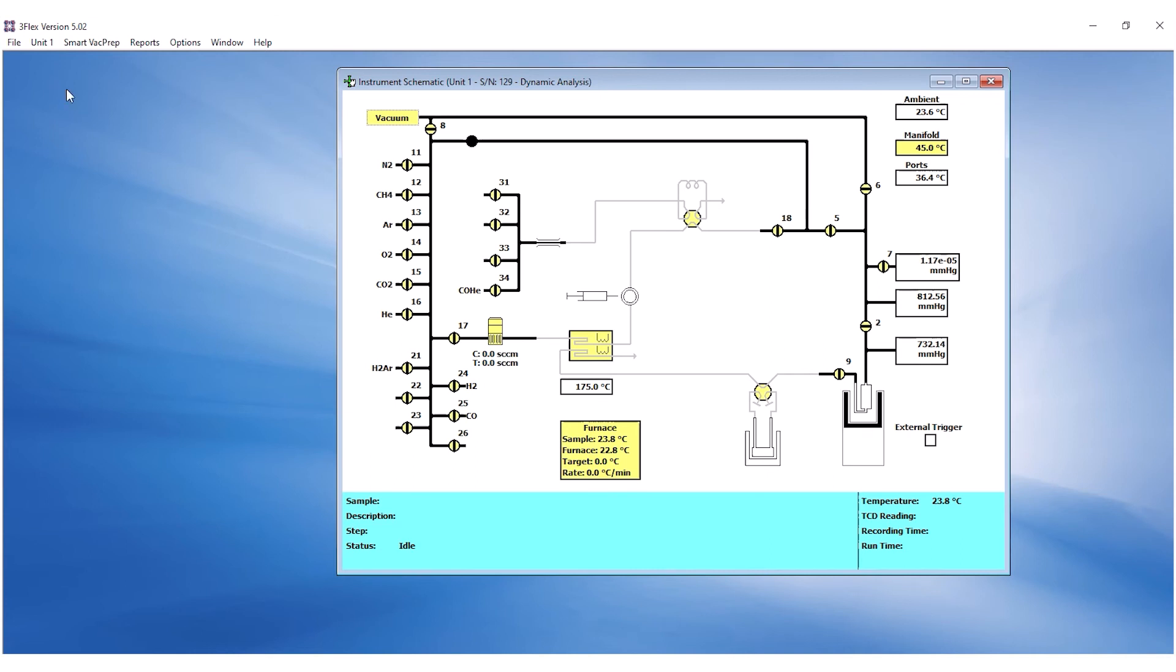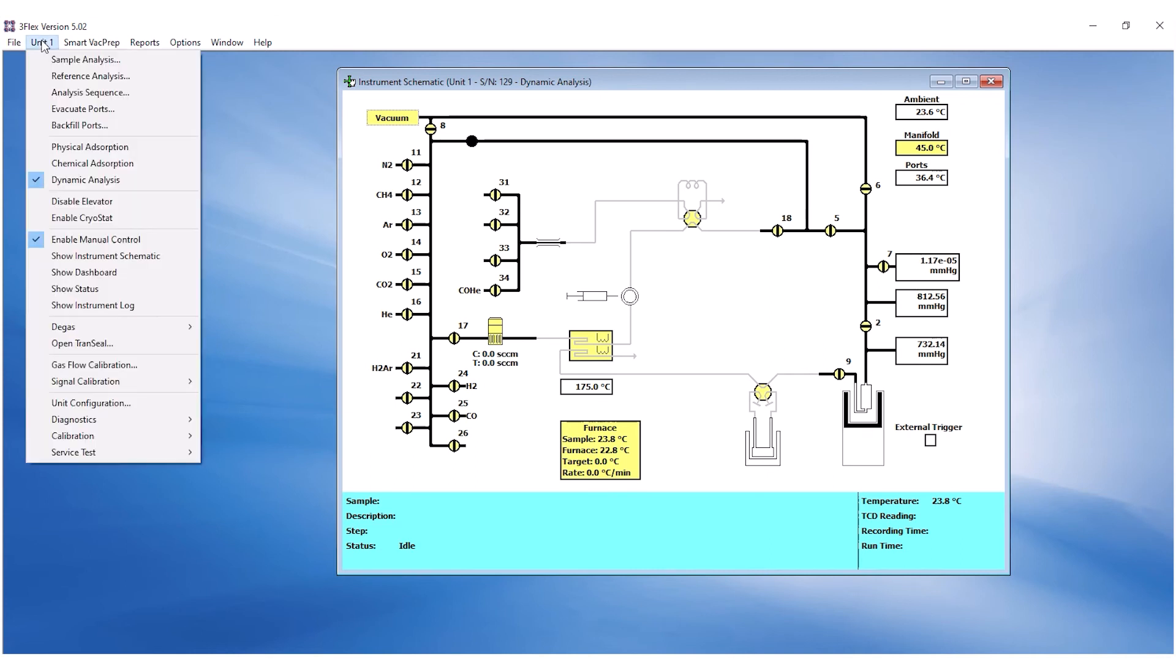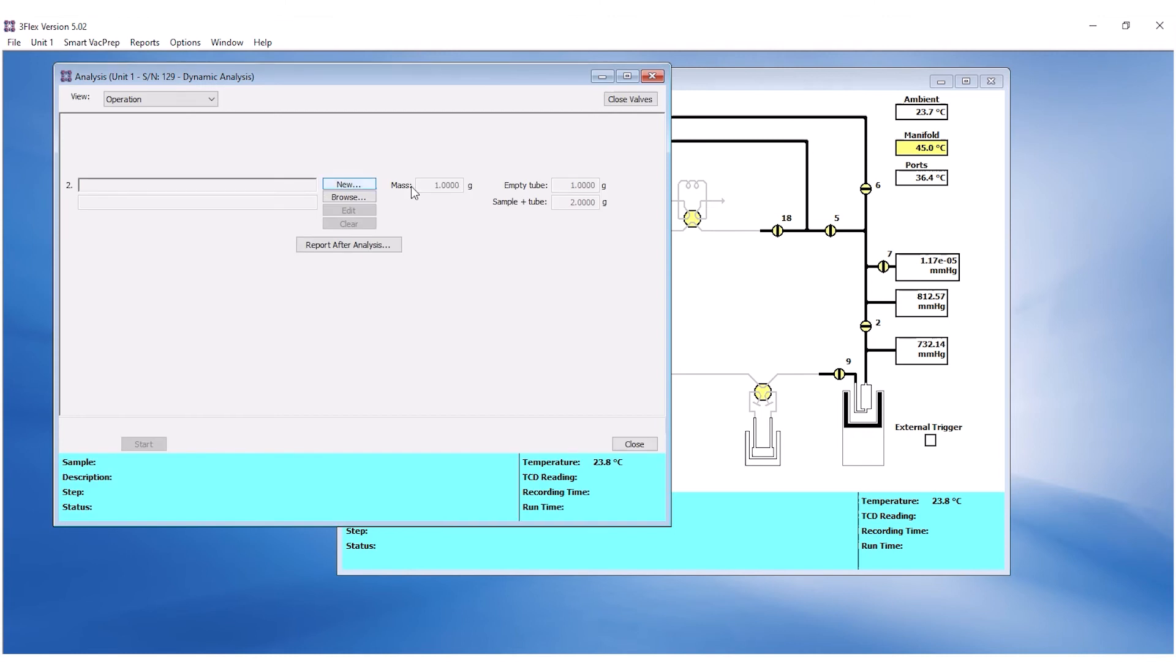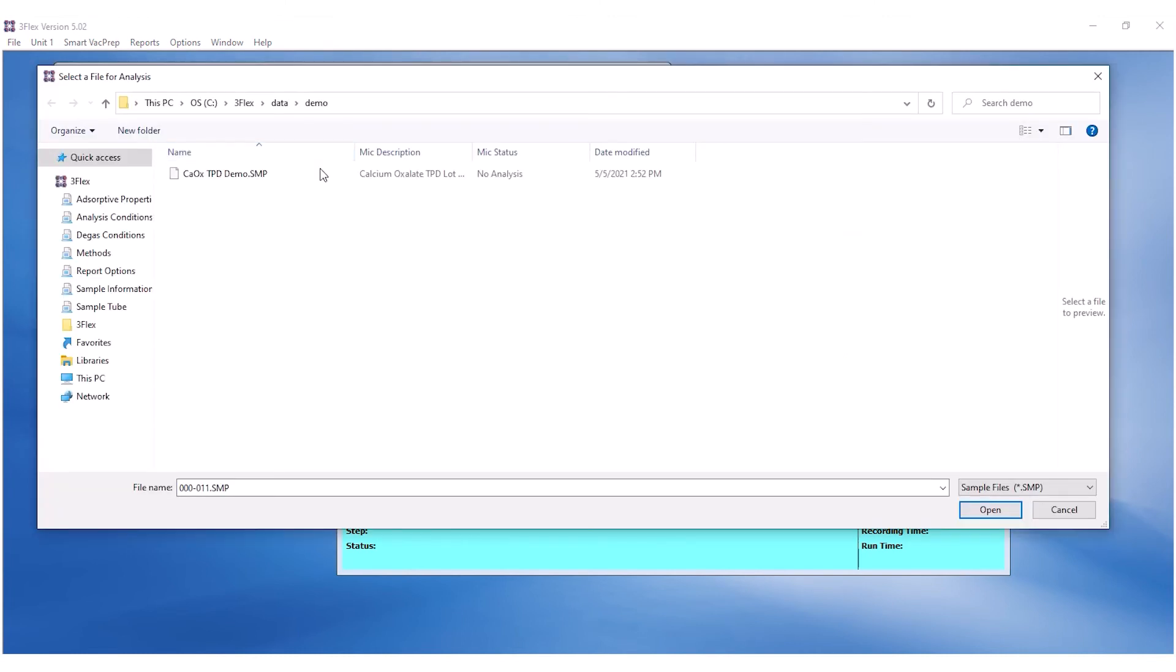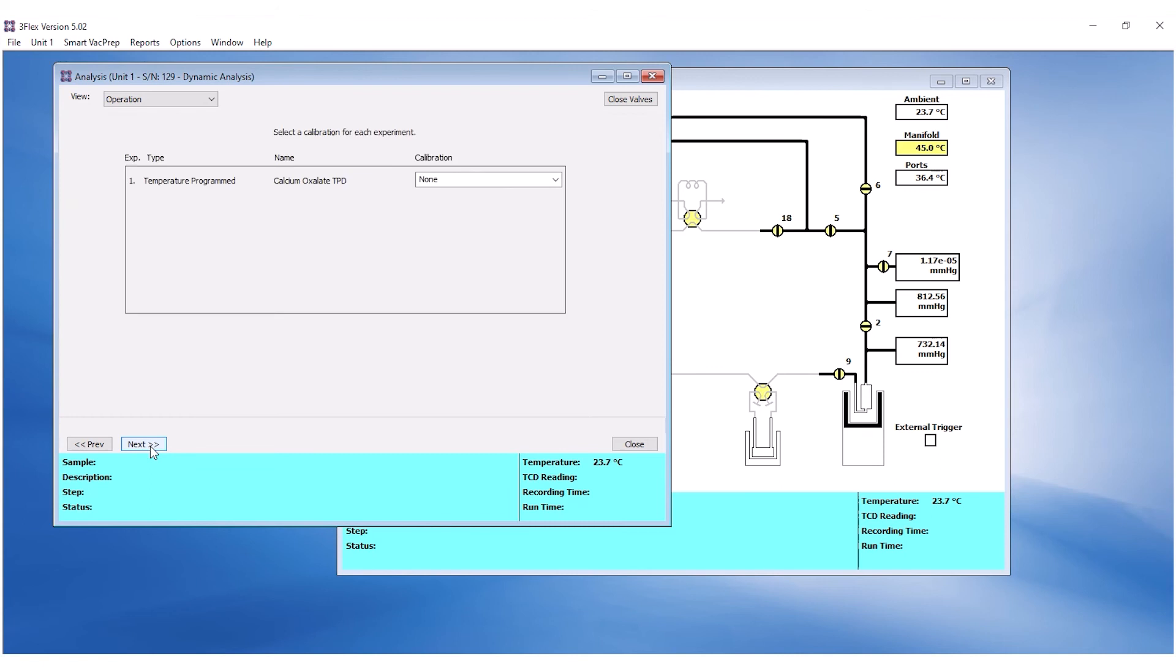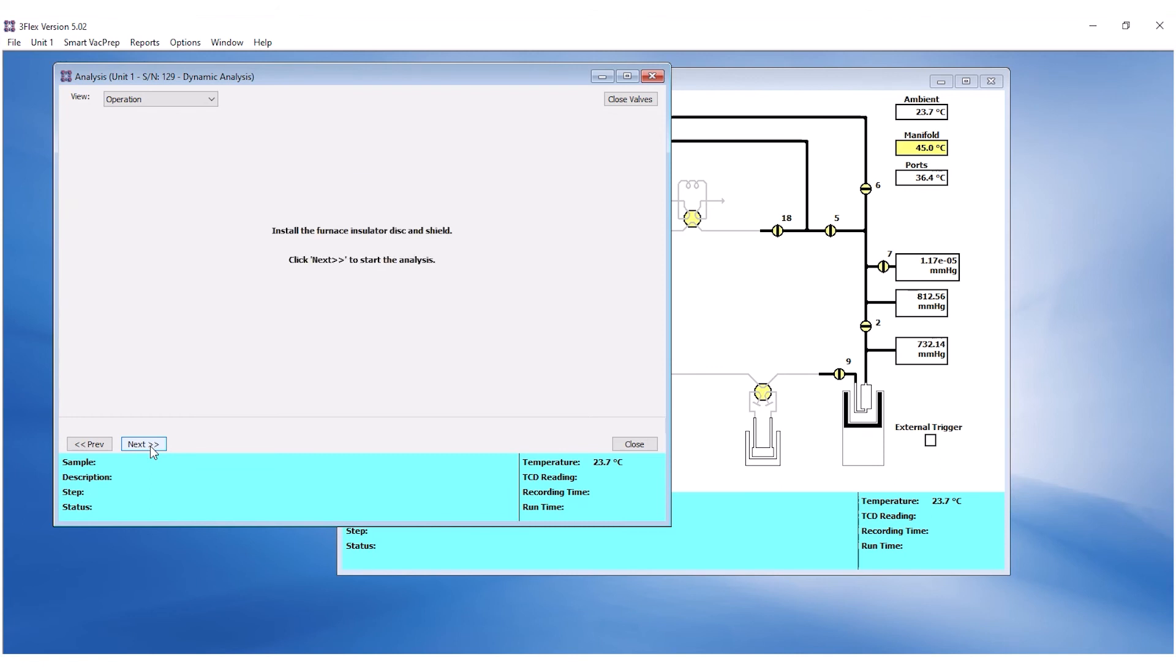To start analysis, go to the Unit menu and click on Start Analysis. Click on Browse to load the sample file and click Start. No TCD calibration is needed for the experiment, so click Next without any calibration selected.